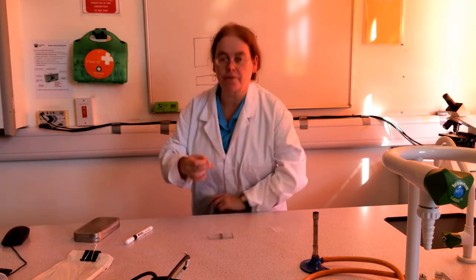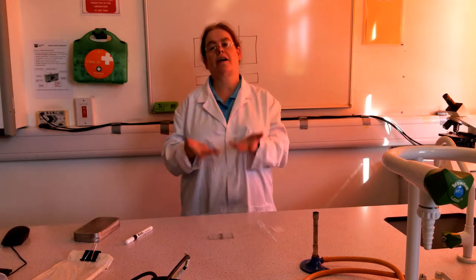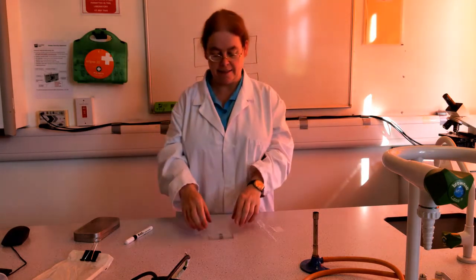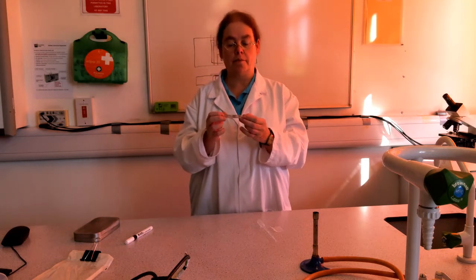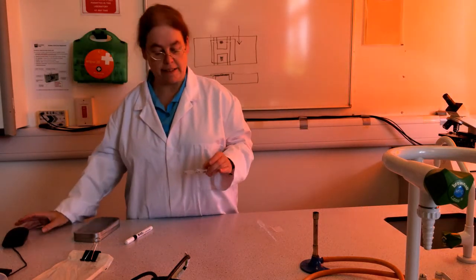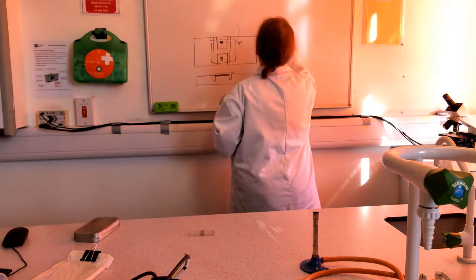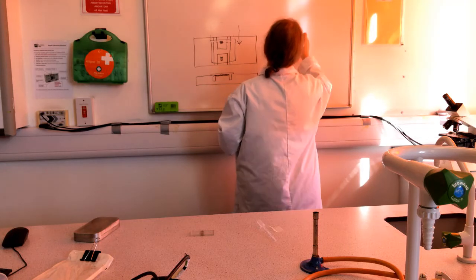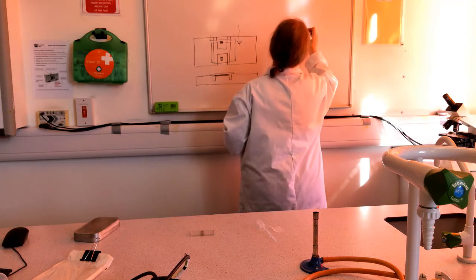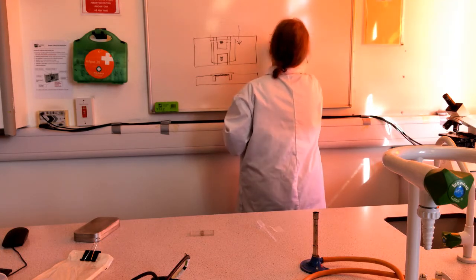I would generally advise only doing one side of a haemocytometer. If you do two, the cover slip sometimes floats off and then it's come loose. But that haemocytometer is now actually full. And when I look down the microscope, what I will see is a tiny grid, typically 4 by 4, each section of the grid, 4 squares, that is, like so.